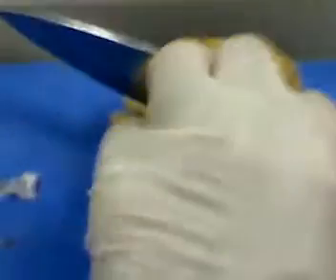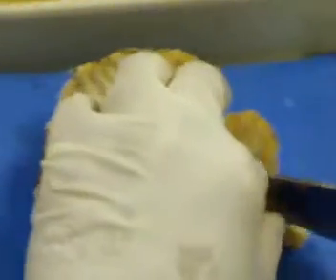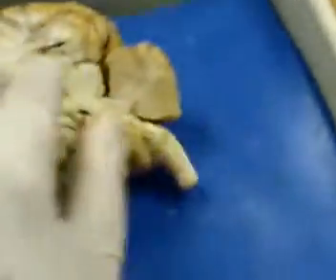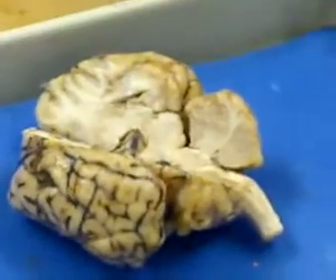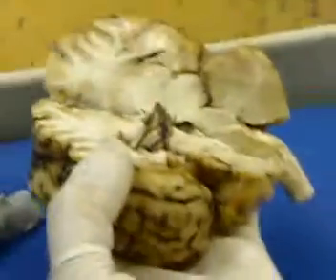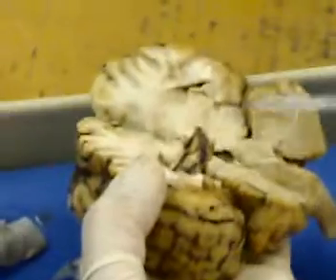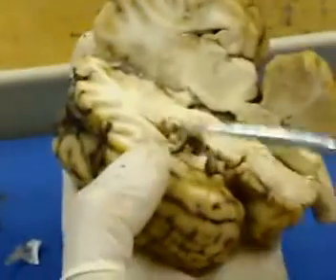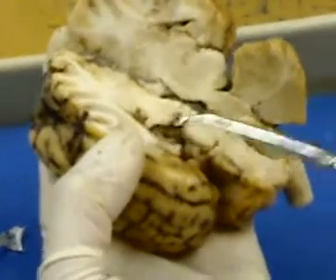Sometimes you see I stopped by to see because it was turned a little bit, and I don't cut both the parts apart from each other. I can do that, but if I keep both the parts together, if I cannot see one structure on one side, then I can show you on the other side. So that is the advantage of keeping that. And this is choroid plexus. Have you talked about it in the lecture? No? Okay, don't worry, then let me put it down.